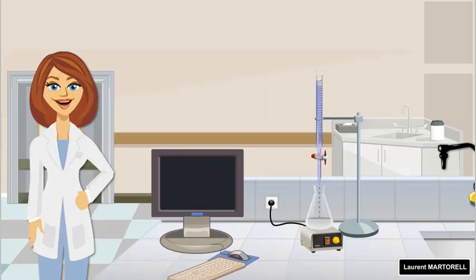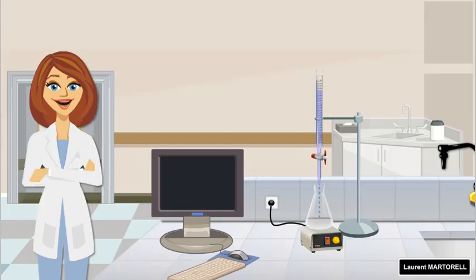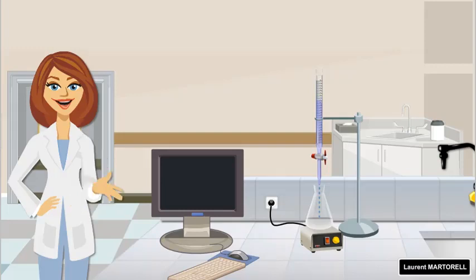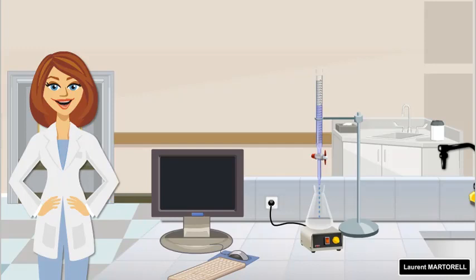The titrant is added in small portions until the indicator just changes its color. Drip titrant into the analyte until the change of color is permanent. Observe the reaction closely to detect sudden changes in color. To increase contrast, you can place white paper between the flask and stirrer. Slowly drip the titrant and keep watching the reaction in the flask closely.